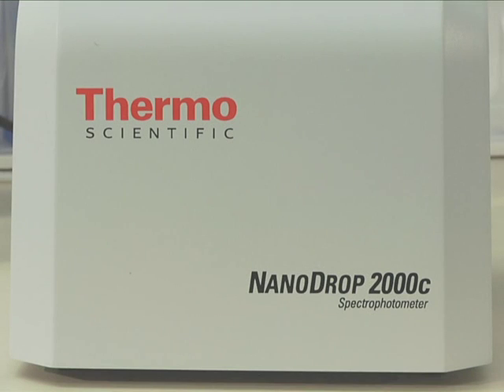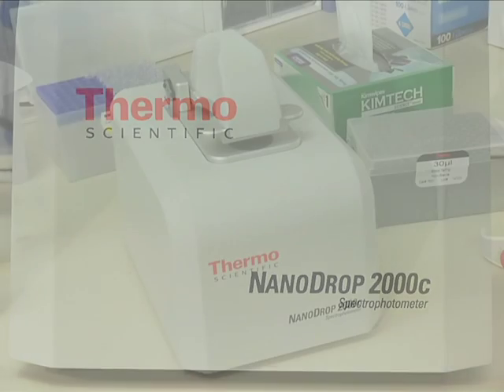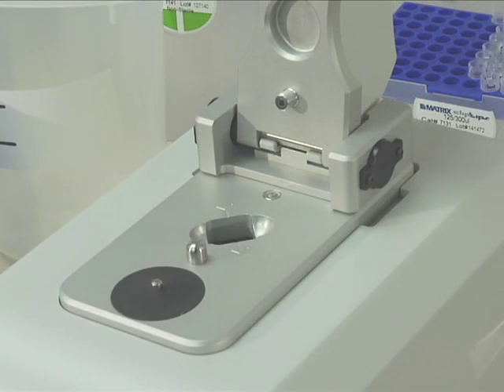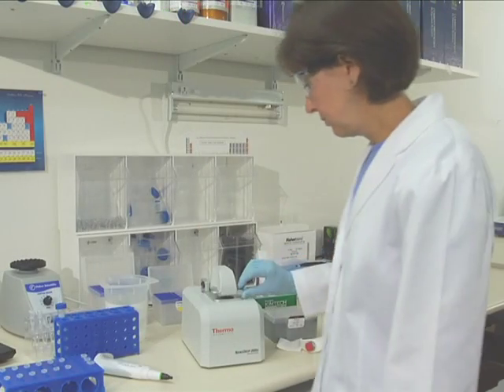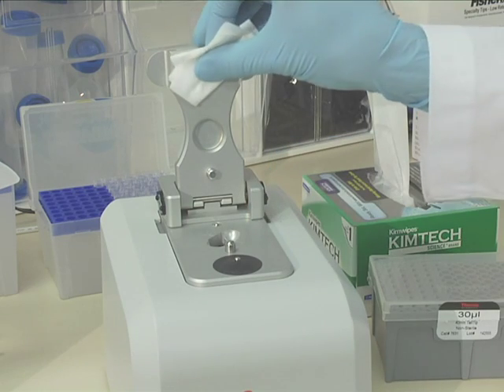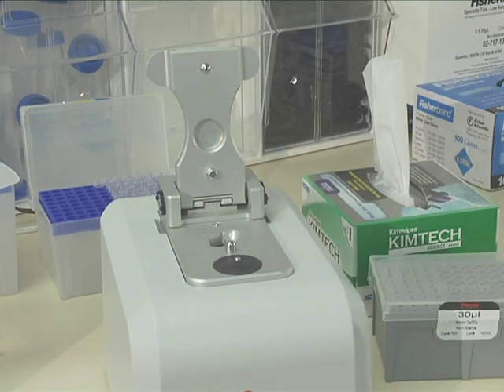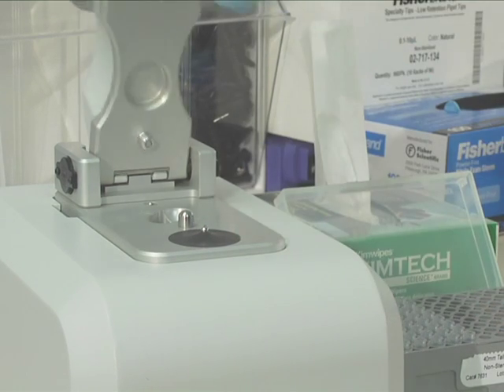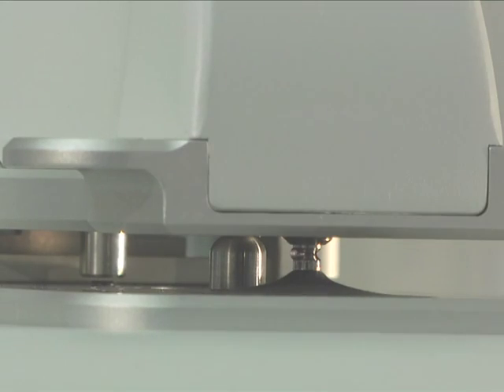The NanoDrop 2000C spectrophotometer uses an innovative sample retention system that relies on the surface tension of liquids to hold and measure microvolume samples between two optical pedestals without the use of cuvettes or capillaries. The micro sample is placed directly on top of the detection surface and a liquid column is created between the ends of the optical fibers by surface tension.